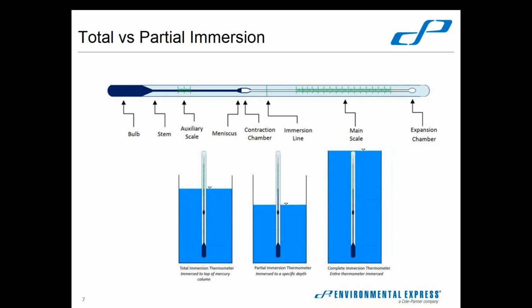So when you're taking temperatures, you can either take the temperature of an object, or you can take the temperature of the surroundings, the environment in an area. The best example of that is in an incubator or an oven versus taking the temperature of a sample. So the incubator or the oven is an environmental temperature versus a sample is a specific object temperature.